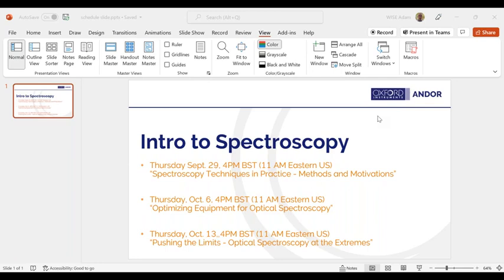Difference between spectrometer and detector. I'm playing it so fast and loose with my terminology here. A spectrometer is that which separates and measures the light. The detector is the part that's actually doing the measurement. So I didn't really draw a distinction, and also the distinction itself is a bit fuzzy.